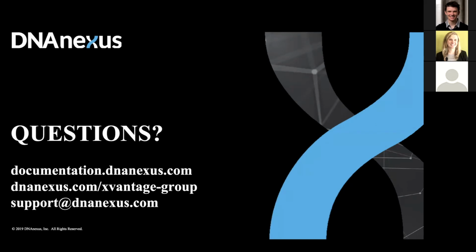So you can track both compute and storage within DNAnexus. You can also put limits on your total amount of spend at an org level so that you can say, hey, I just want to spend about $10,000 in compute and storage for a particular organization. So we provide those cost controls as well.